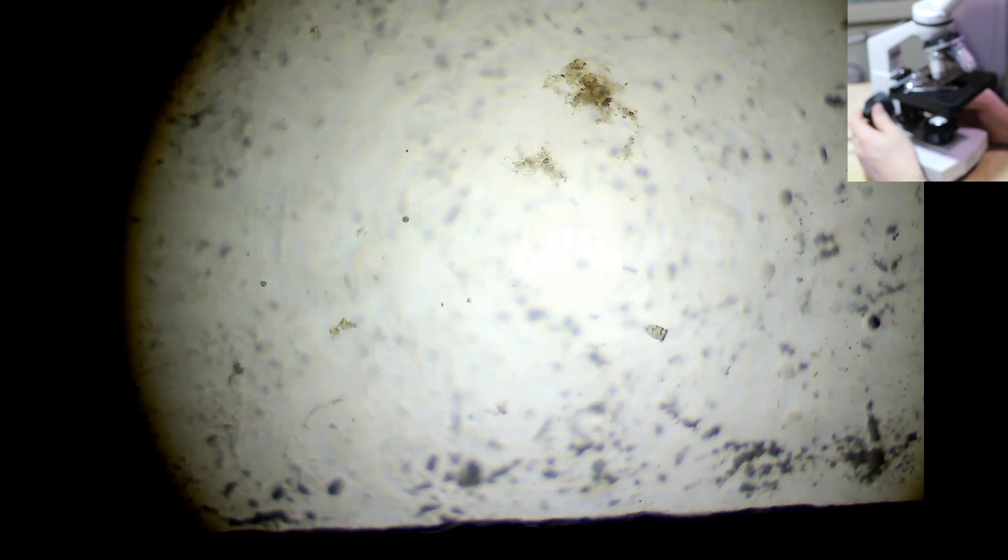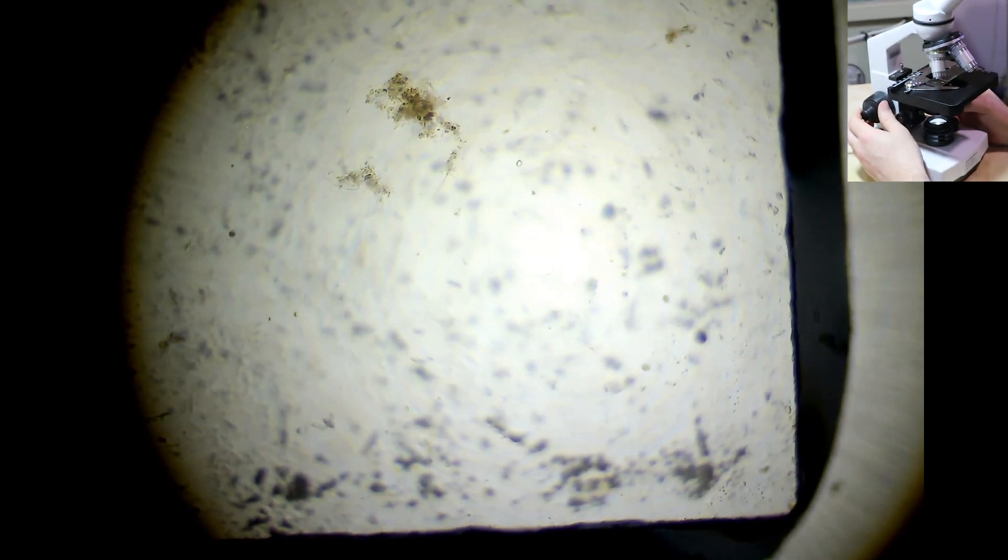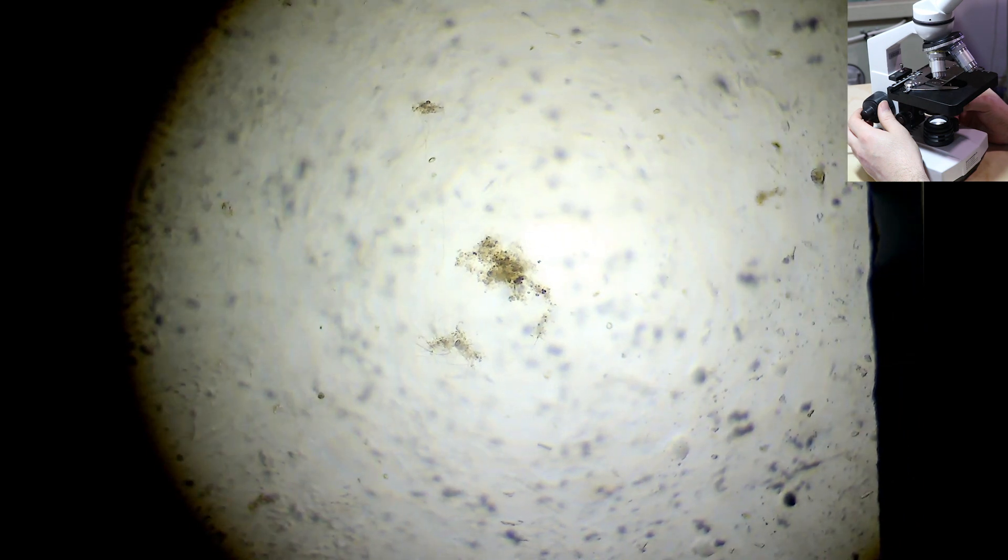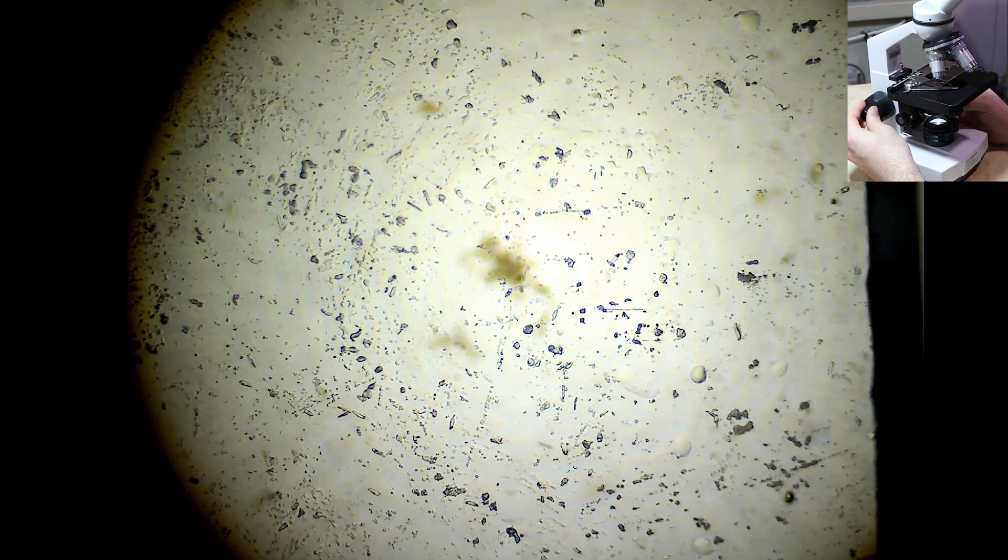You will find a lot of these dots. I always find these dots. Sometimes you get worms. I would expect to see a worm, to be honest. I think that's one of those acorn things. You see them occasionally. Sometimes they're faster than others. Sometimes you can see them stood still, and they're quite good to look at when they're stood still because they've got little bristles on them.